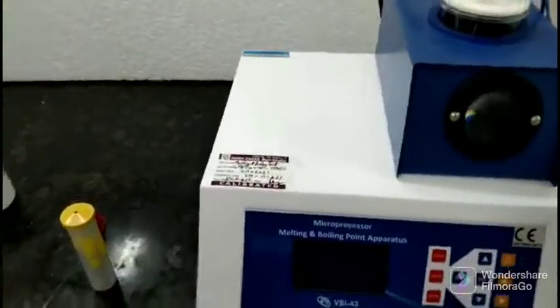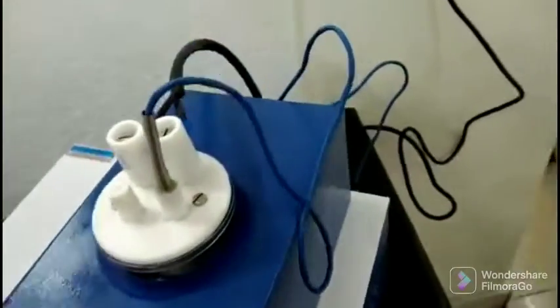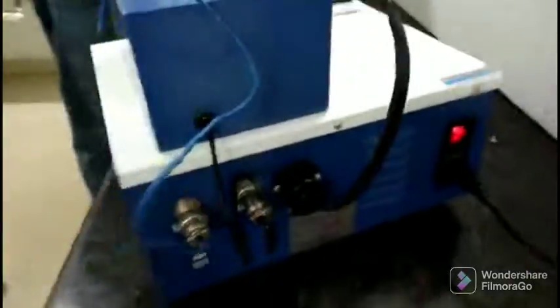This is your microprocessor based melting and boiling point apparatus. First of all, we just connect the power supply with this instrument. There is a power socket given. Just connect it with your socket and press the key like that.